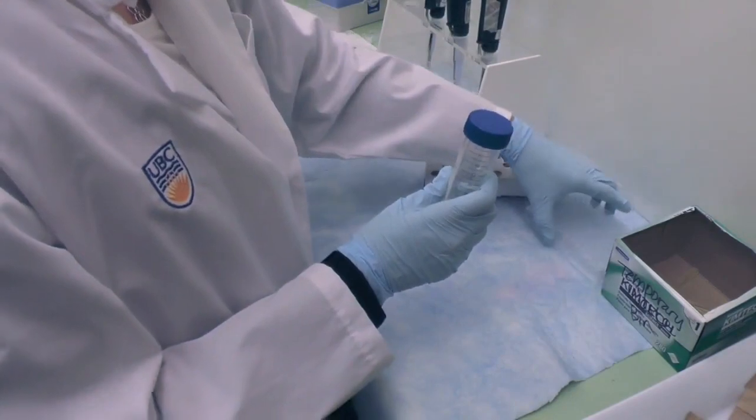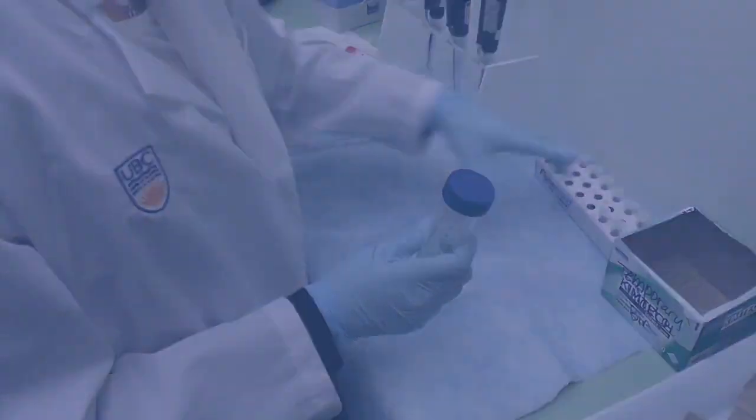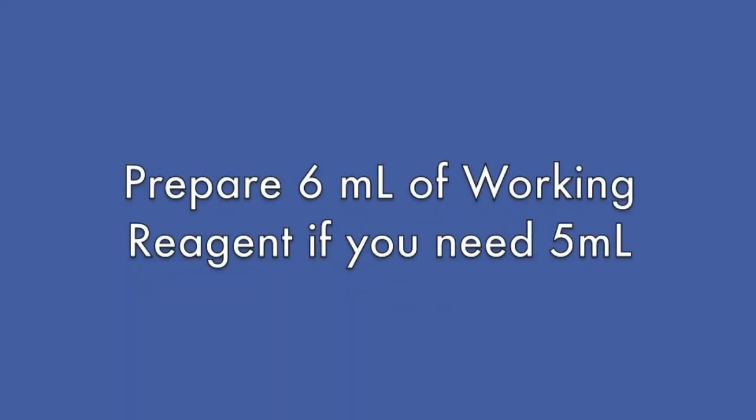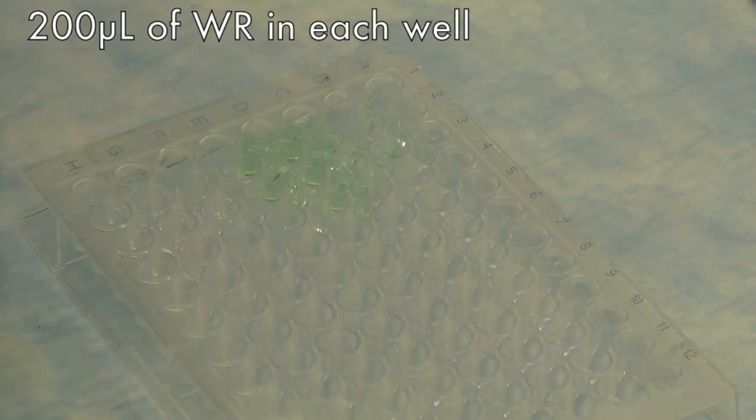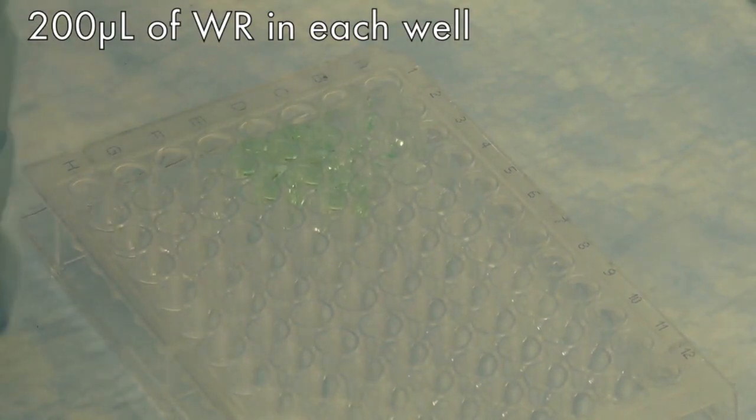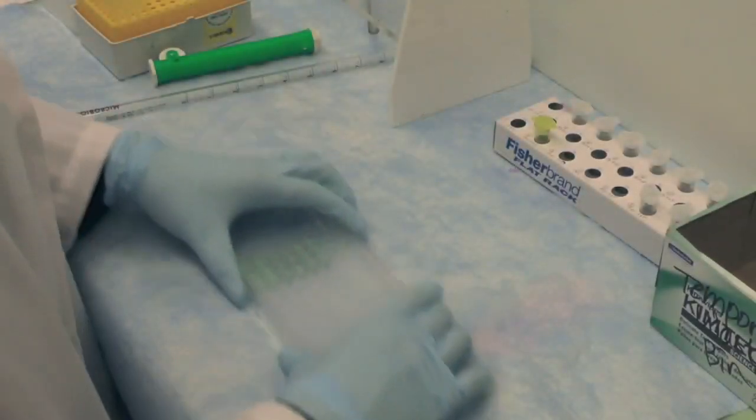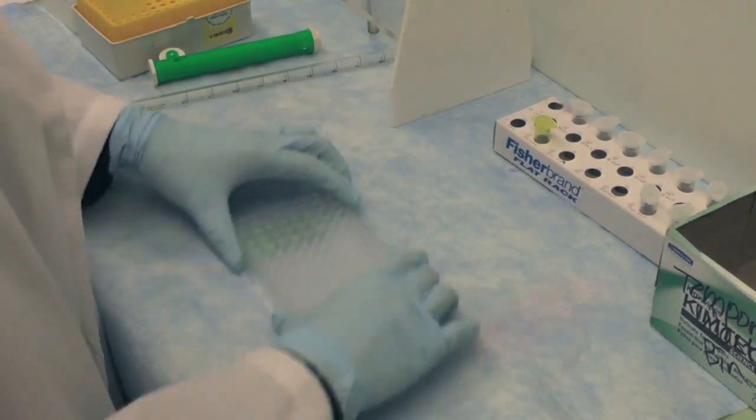It's recommended that you always prepare an additional 1 ml of working reagent just in case. Mix the BCA working reagent and add 200 microliters to each well. Move the plate in this way to gently mix the solution.